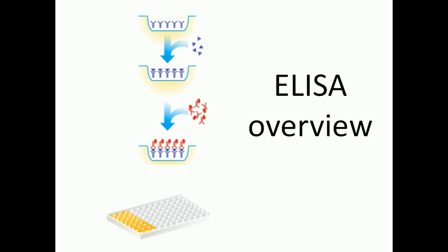Now this antibody along with the linked enzyme will go and attach to the antigen, right? And then we add the substrate, here it's yellow in color, and it will give some coloration. Due to the coloration we can see the presence of the antigen in those wells. So this is the general idea: we use the antigen antibody interaction to find out whether the antigen is present in our serum or whether antibody is present in our serum.